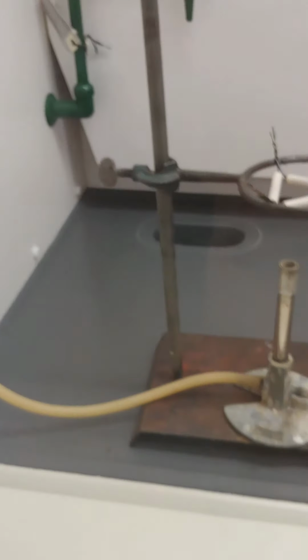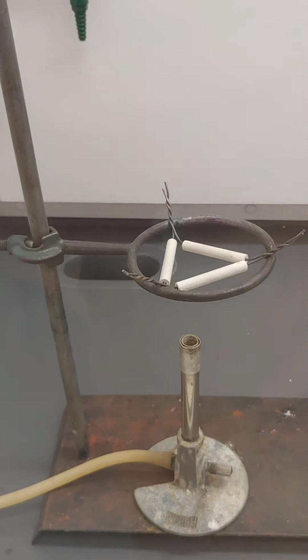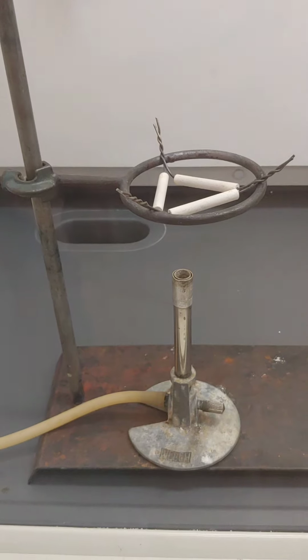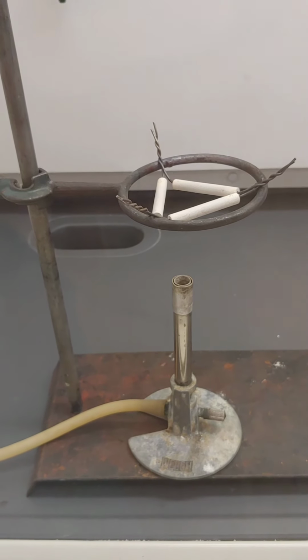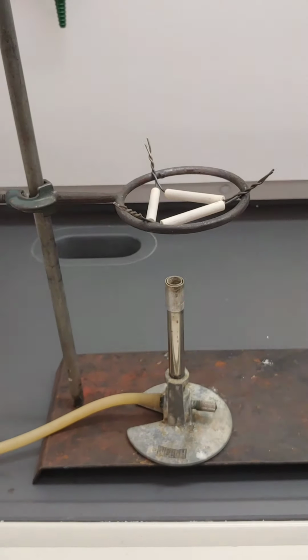And so I'm going to turn on the gas and light the Bunsen burner, and then I'm going to take my dish and set it on that little clay triangle there so that the heat from the Bunsen burner is going to warm up my evaporating dish and get the ammonium chloride to sublime.